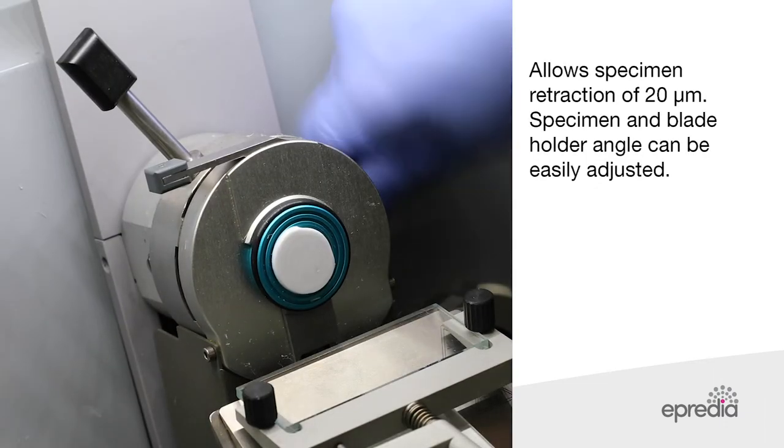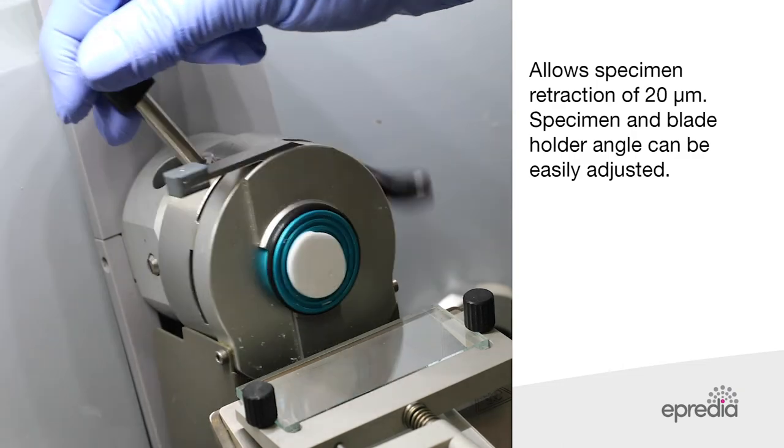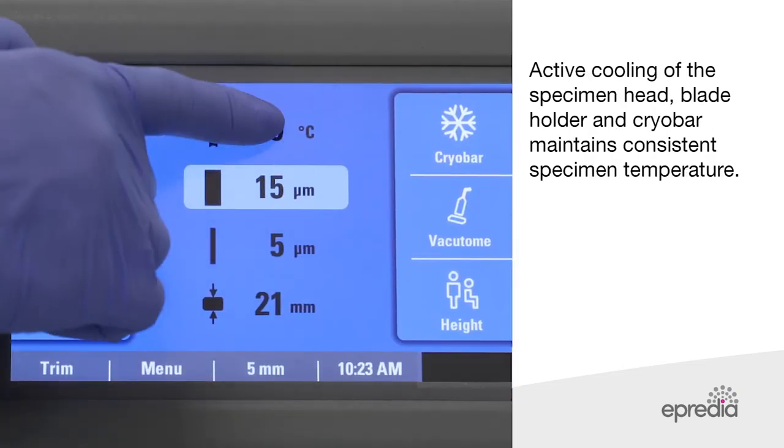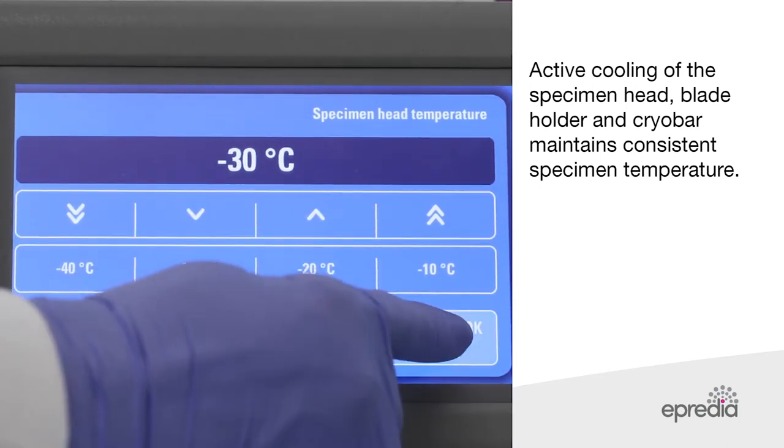The NX50 also allows specimen retraction of 20 micrometres. Specimen orientation and blade holder angle can be easily adjusted. Active cooling of the specimen head, blade holder, and cryobar maintain consistent specimen temperature.